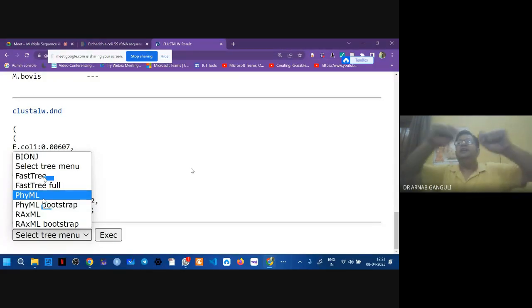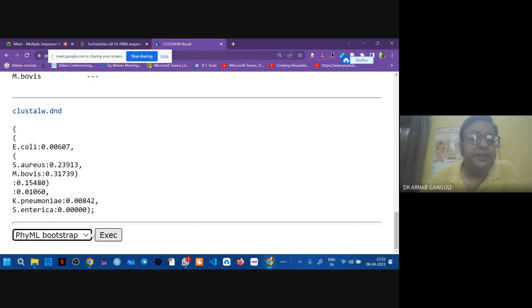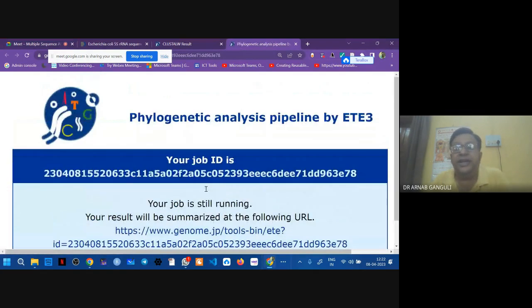Let's try bootstrap and execute. My job is still running. The result is slow because America is about to wake up, and so the server becomes slow.